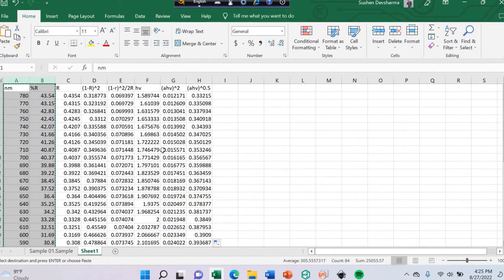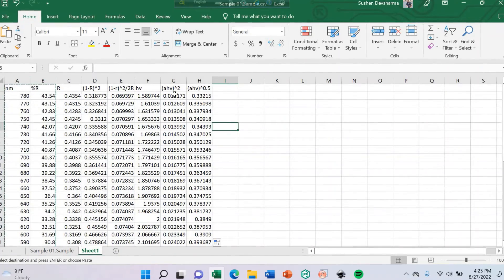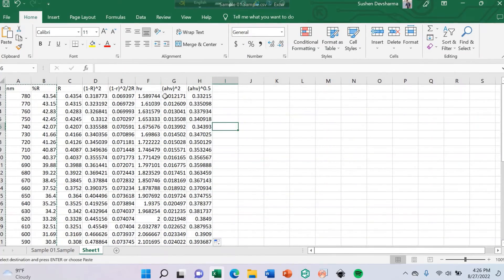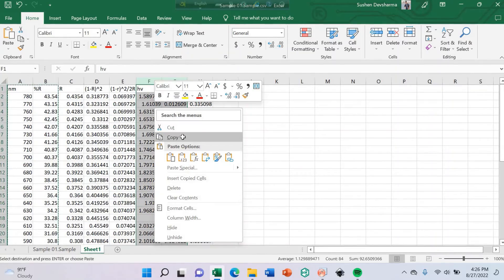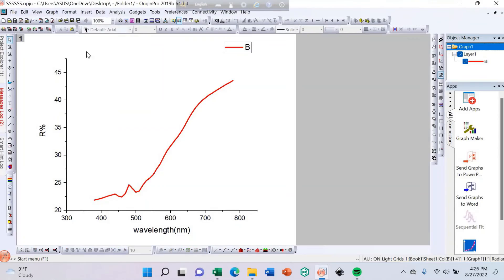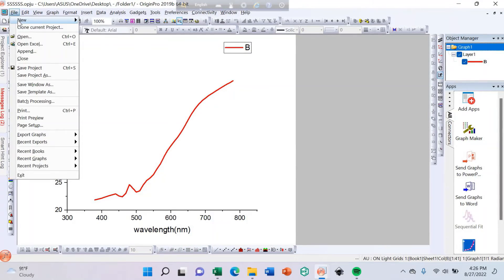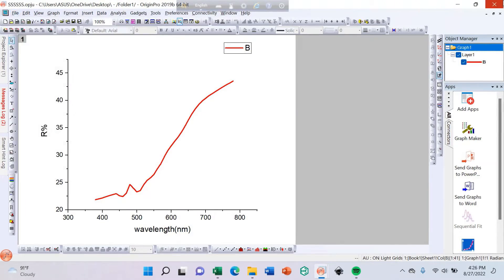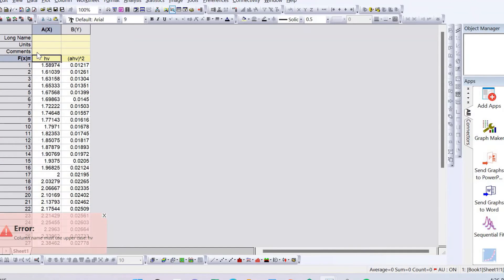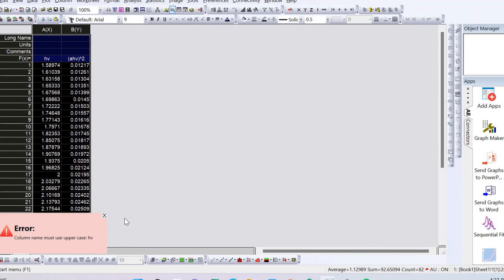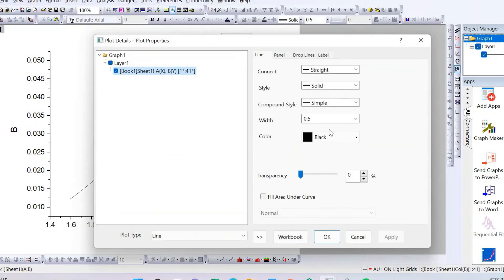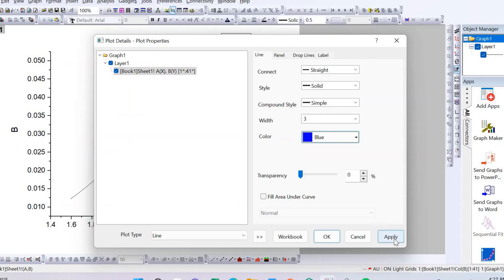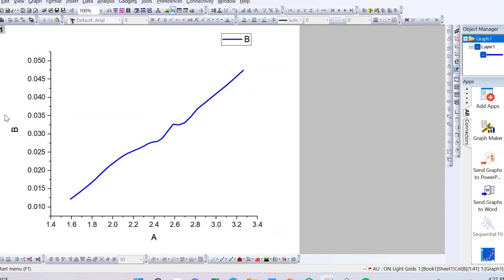Let's go to my Excel file. To determine the direct band gap we can use hν versus alpha·hν squared. Copy this and go to Origin, open a new project, and paste here. Click and go to the line tool. Now you can change the width to 3 and change the color to blue. Apply and OK.